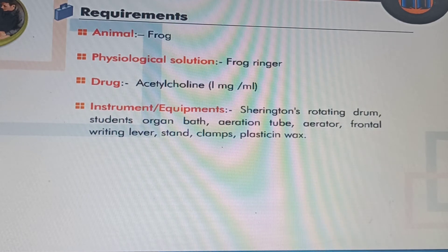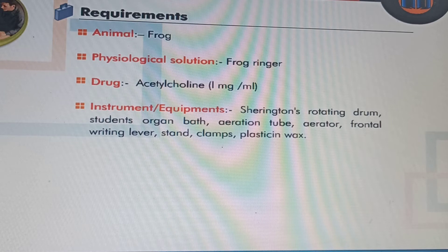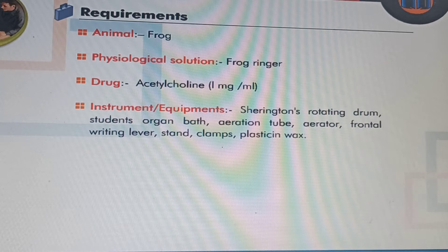Requirements of the experiment include: animal required is frog; physiological salt solution used is frog Ringer solution; drug is acetylcholine 1 mg per ml; and various equipment includes Sherrington's rotating drum, student's organ bath, aeration tube, aerator, frontal writing lever, stand, clamps, and plasticine wax.